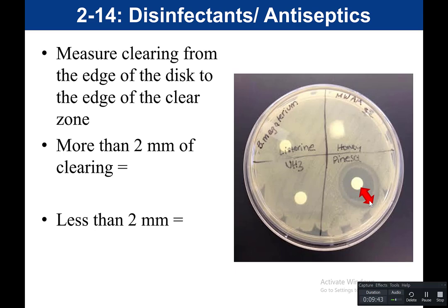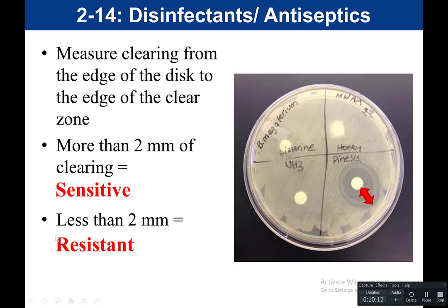If there is more than two millimeters of clearing, meaning a large clear zone, we record that as sensitive. For example, Bacillus megaterium is sensitive to Pine Sol — Pine Sol is effective at inhibiting microbial growth because there's no growth around that disc. If there's less than two millimeters of clearing, we call that resistant. For Listerine, honey, and ammonia, the bacteria grew right up next to the disc, so Bacillus megaterium is resistant to those chemicals.